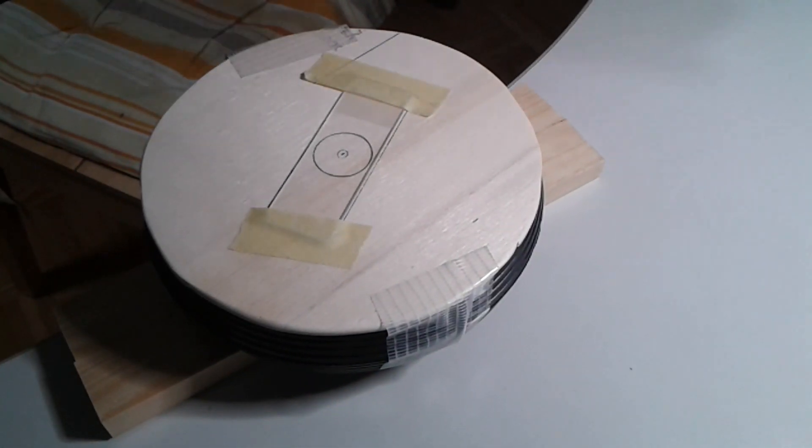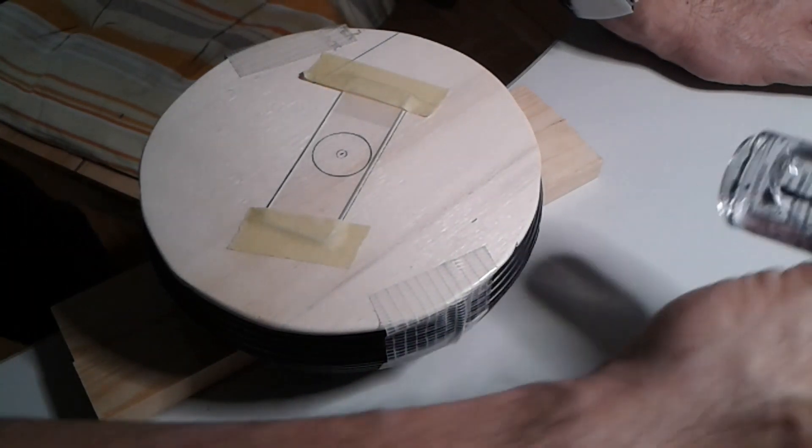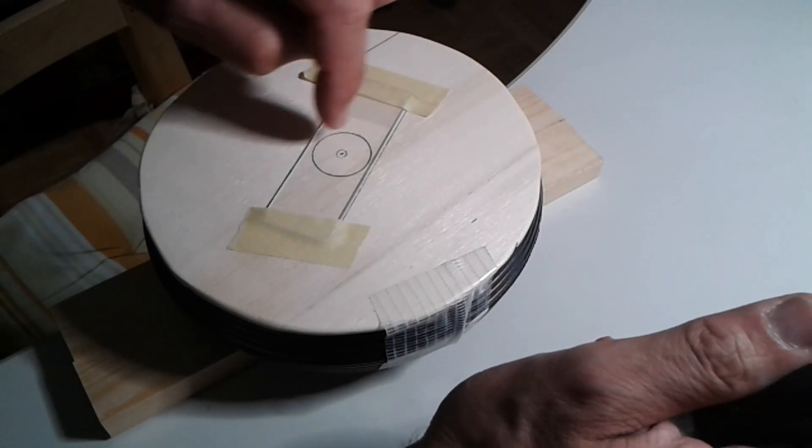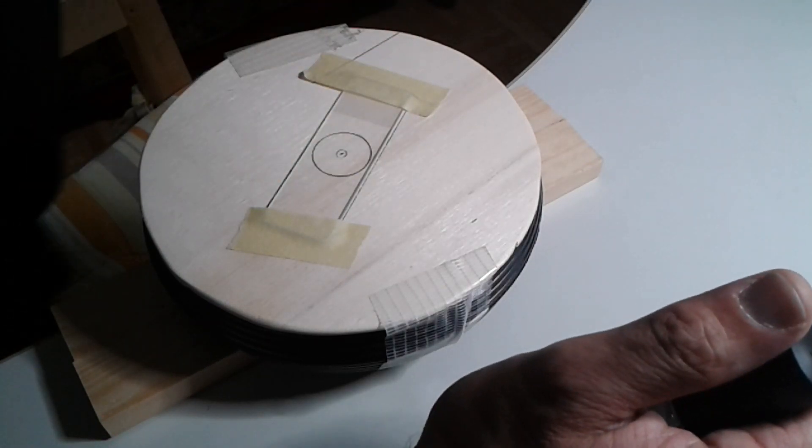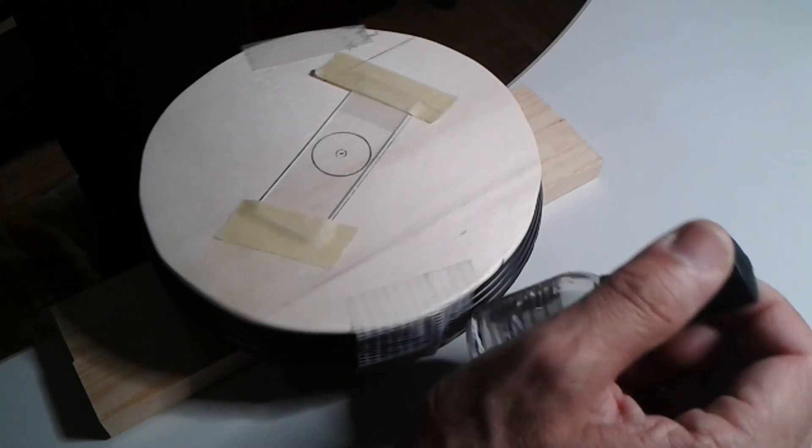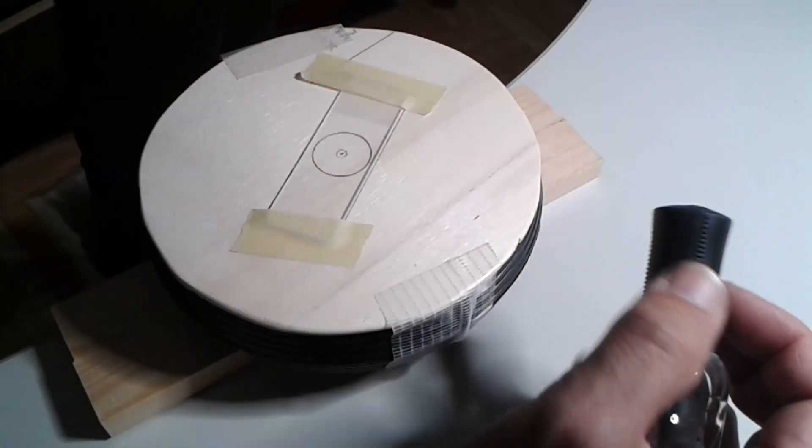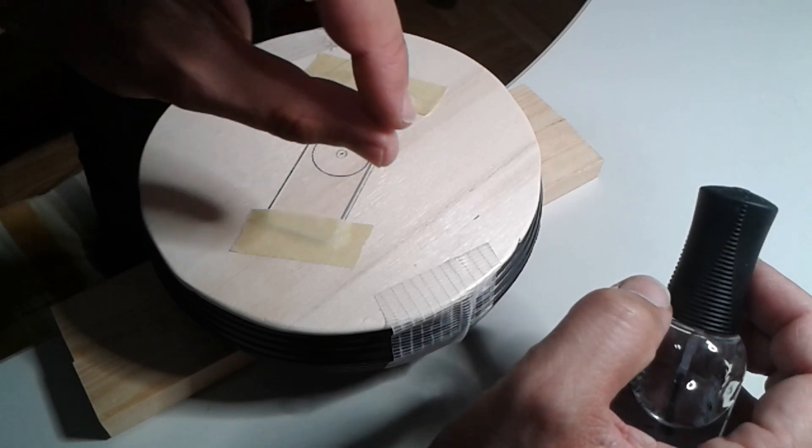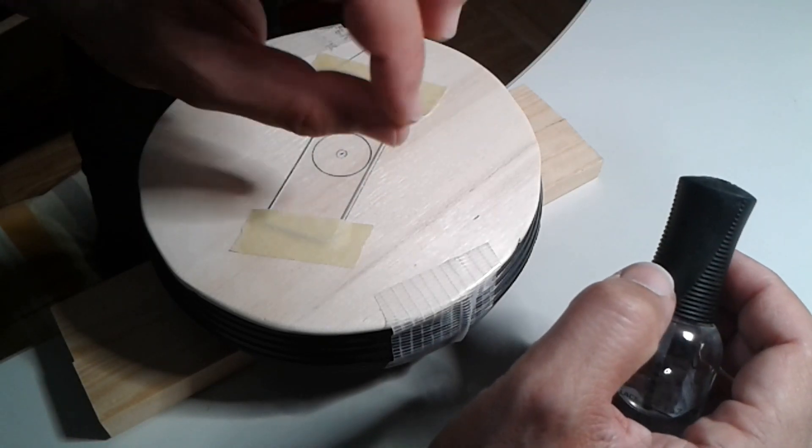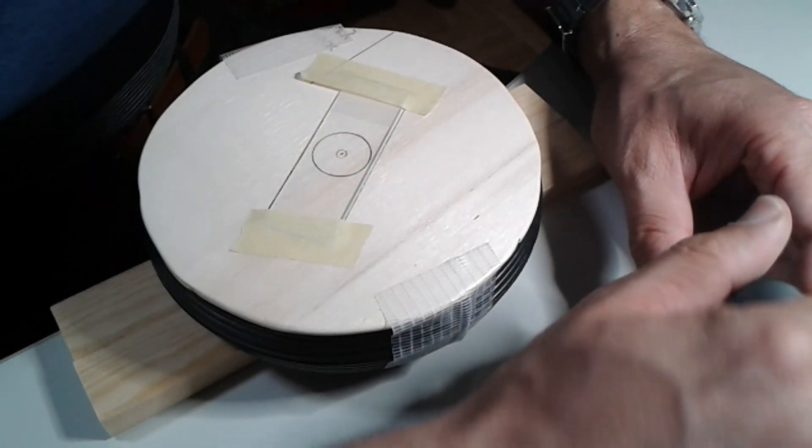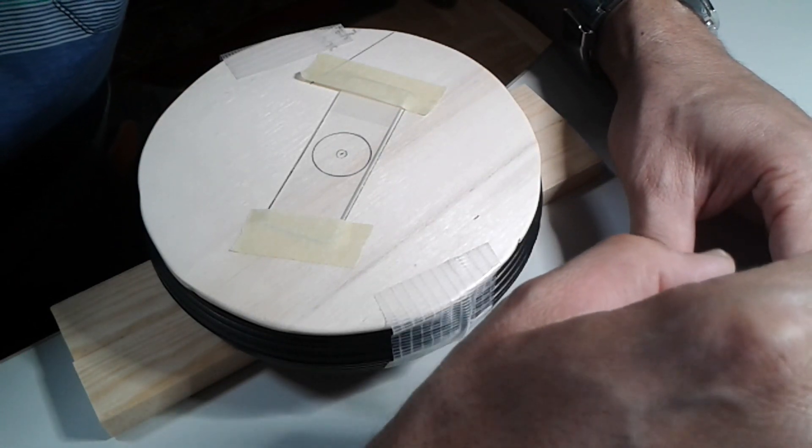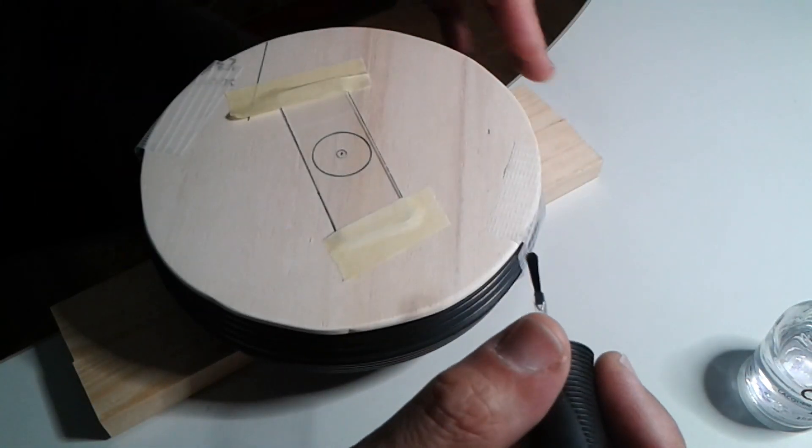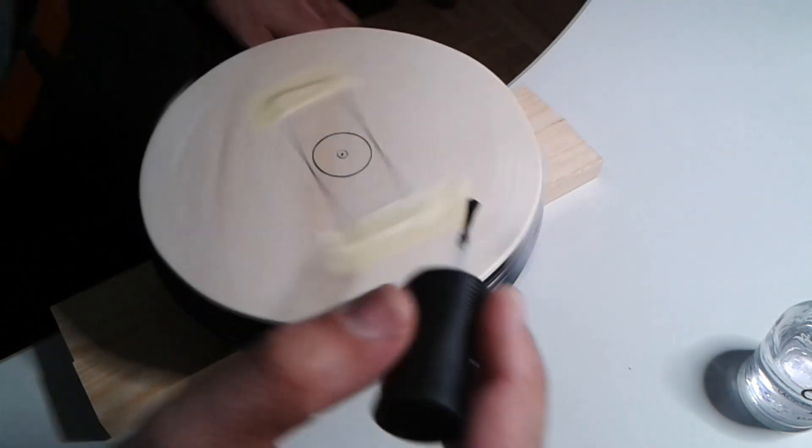Now I would like to apply nail polish right on here because I want to make a so-called dry mount slide. This nail polish, after it dries, will make a certain distance like a spacer for the cover glass. I've never tried this before, this is the first time.